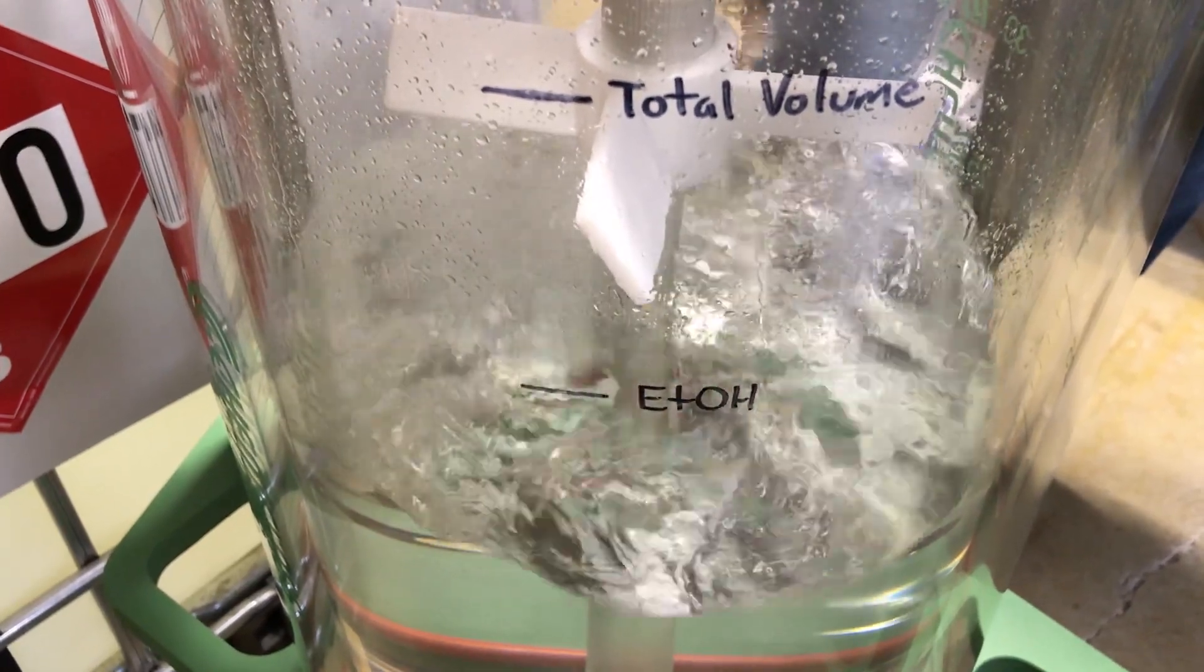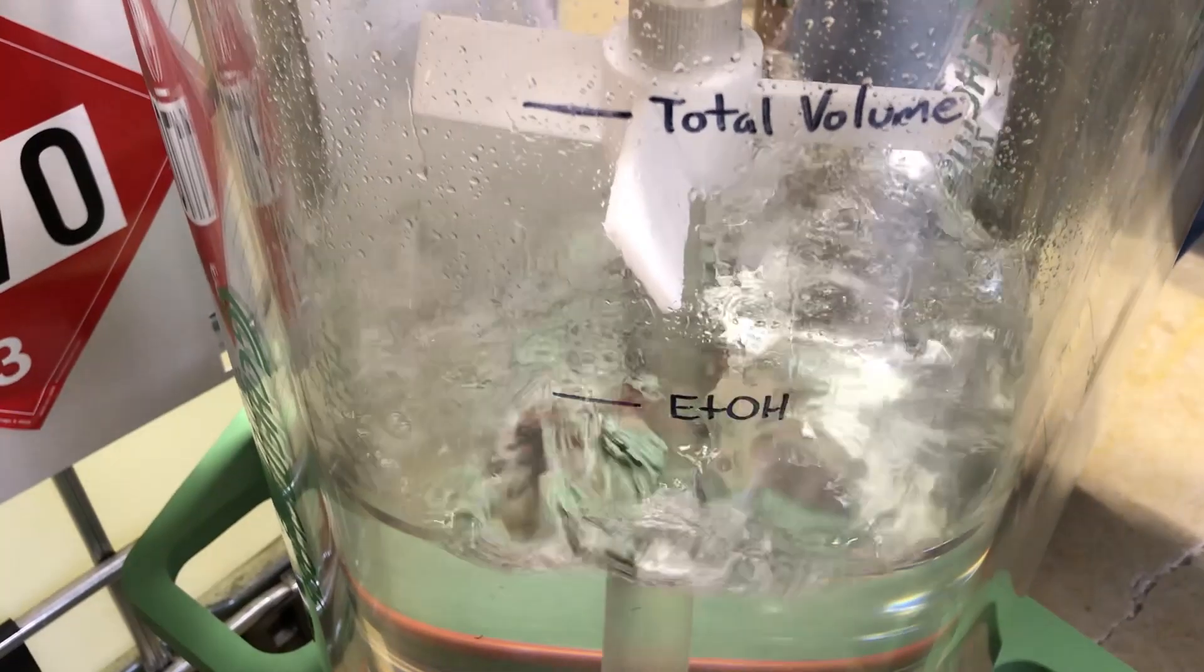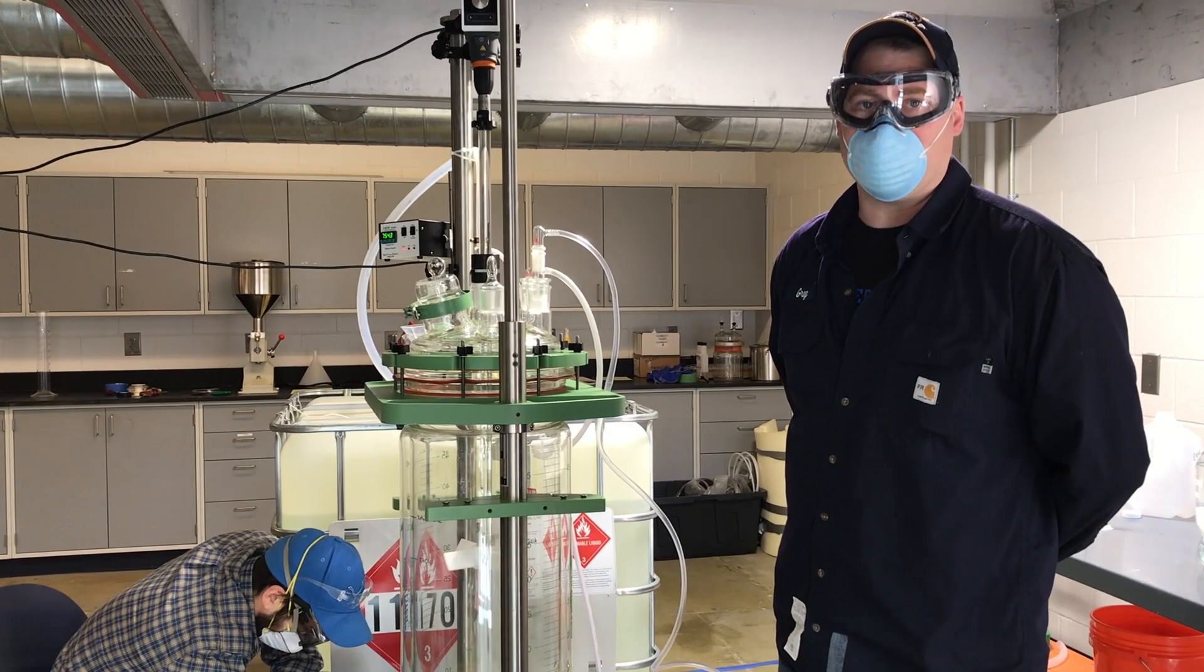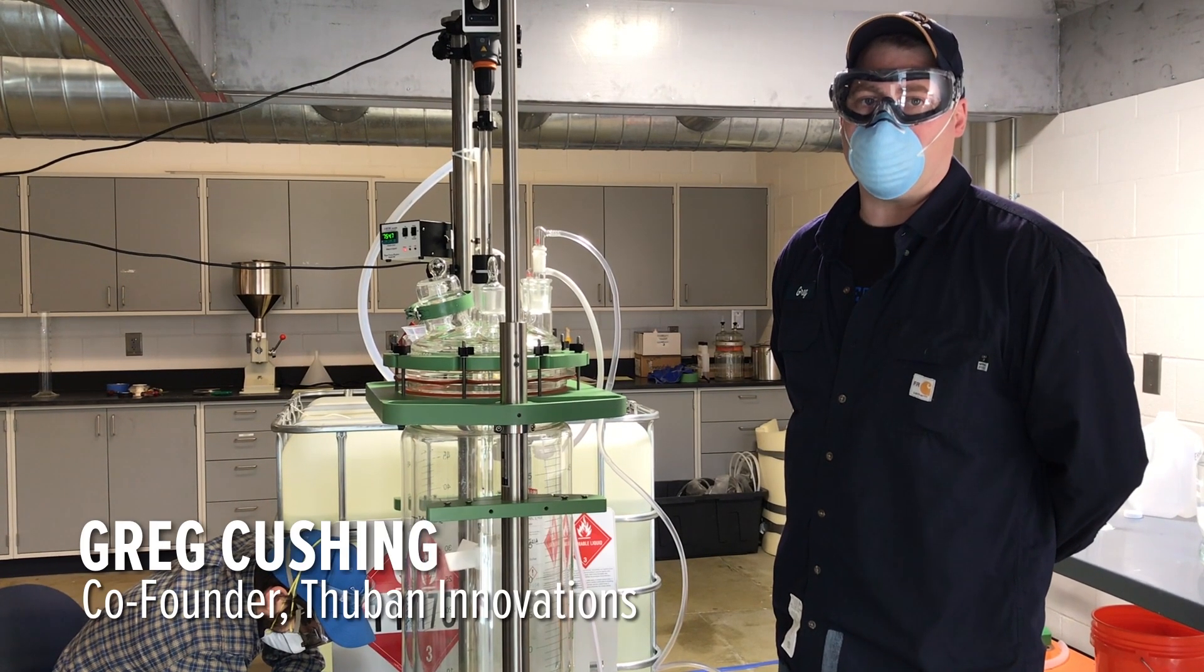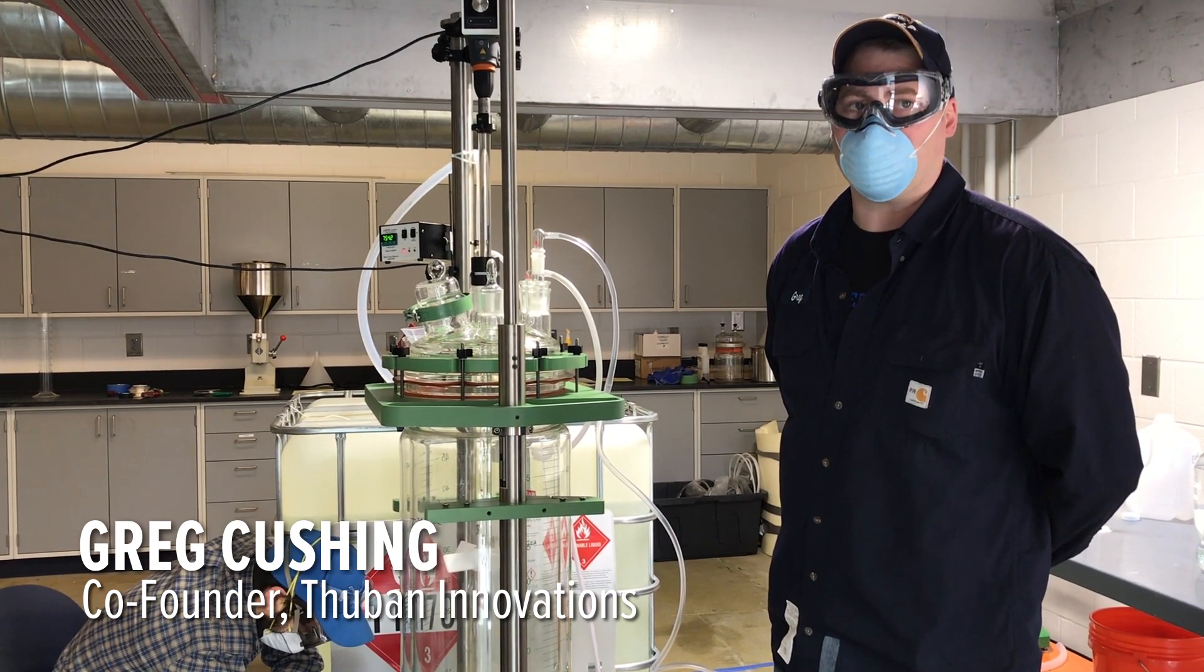We're making hand sanitizer according to the FDA recipe that uses ethanol, isopropyl alcohol for denaturant, hydrogen peroxide, glycerin, and water.